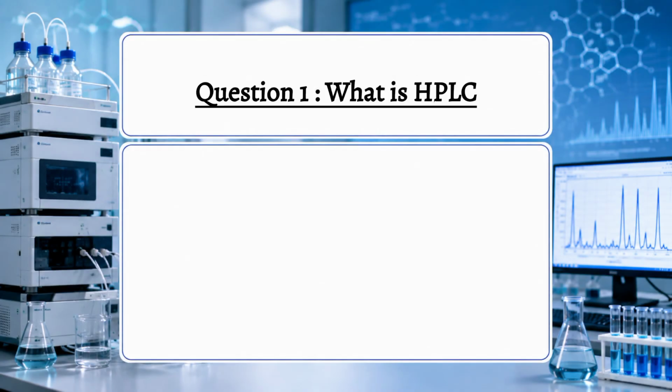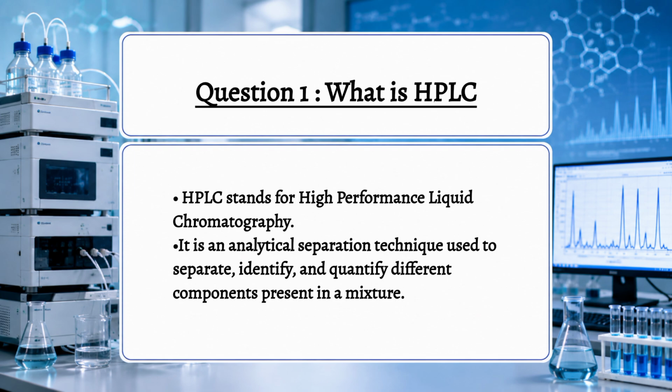Question 1. What is HPLC? HPLC stands for High Performance Liquid Chromatography, or High Pressure Liquid Chromatography. It is an analytical separation technique used to separate, identify, and quantify different components present in a mixture.